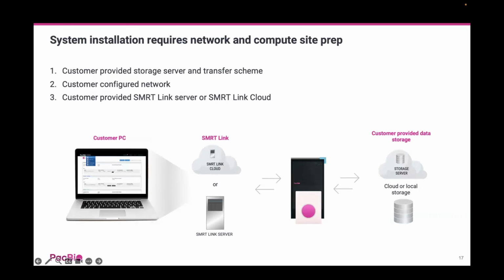SmartLink can also be used to set up where the instruments transfer data to, whether it's a local storage server or somewhere on the cloud, after a sequencing run is complete.